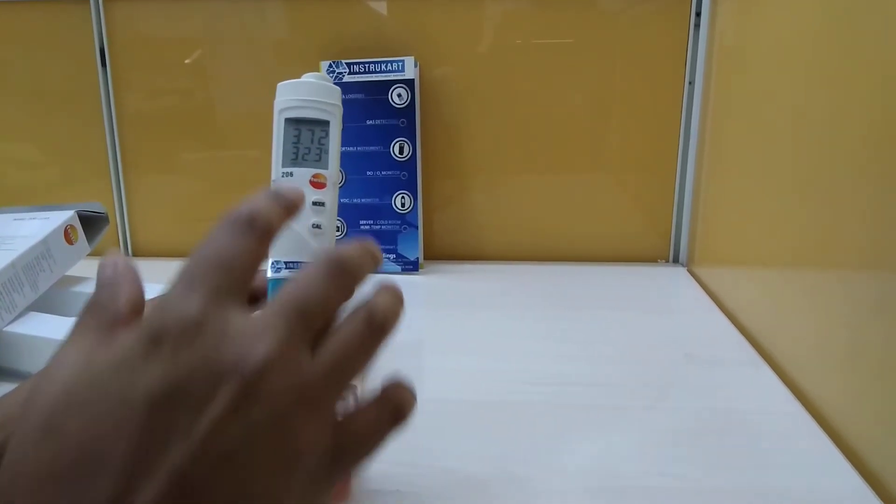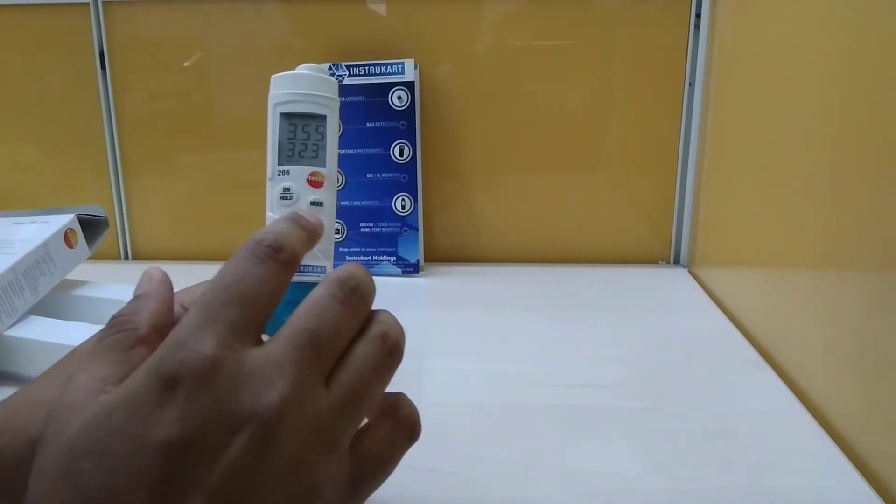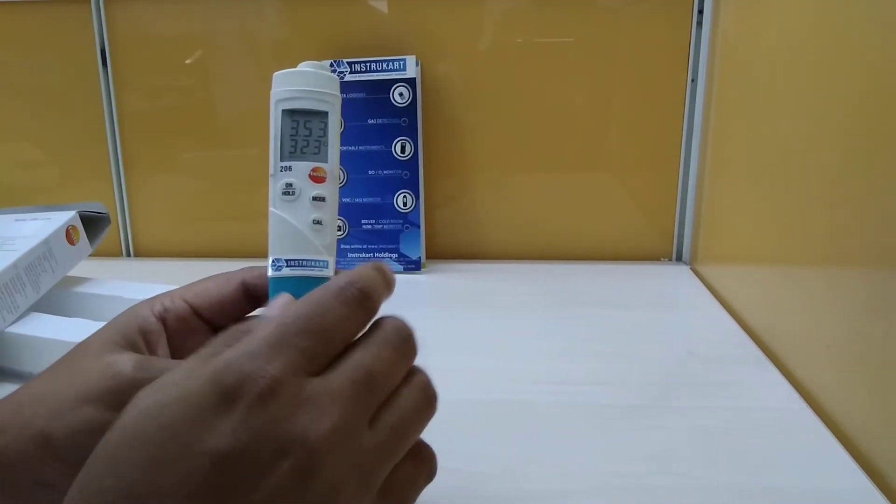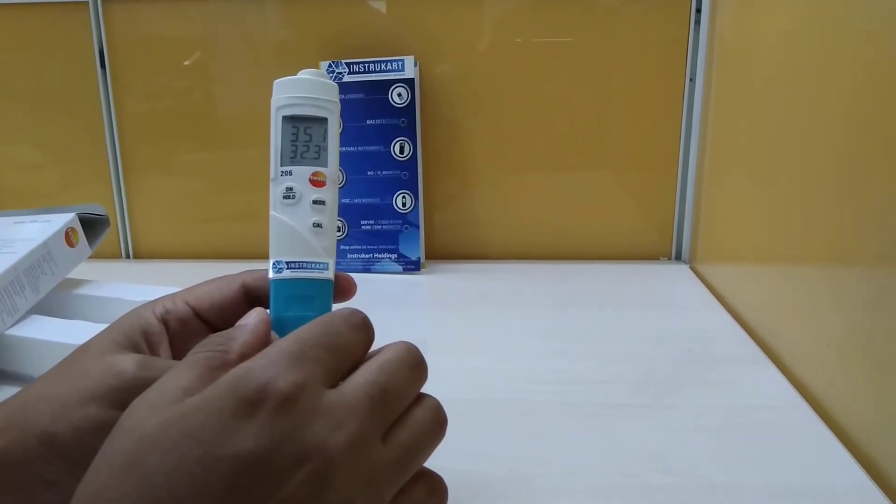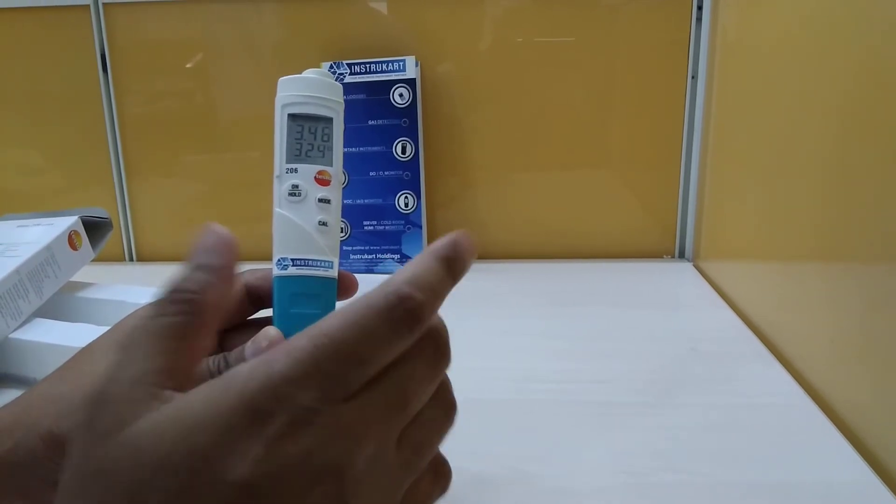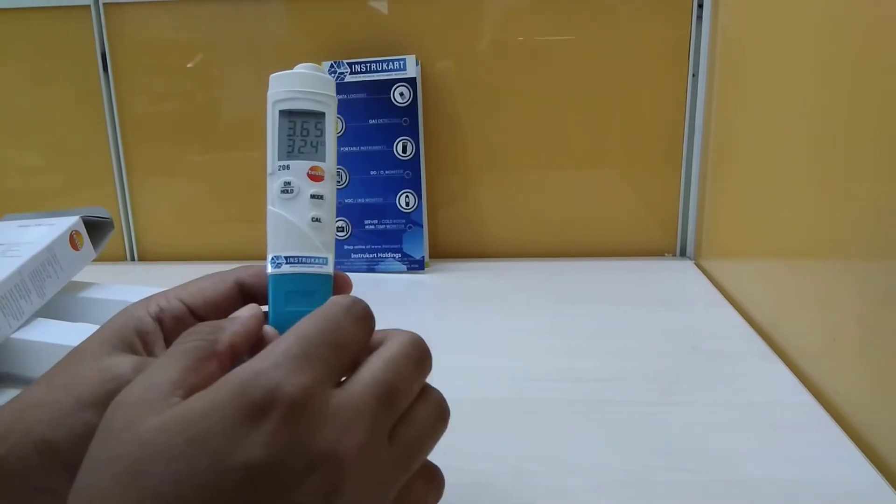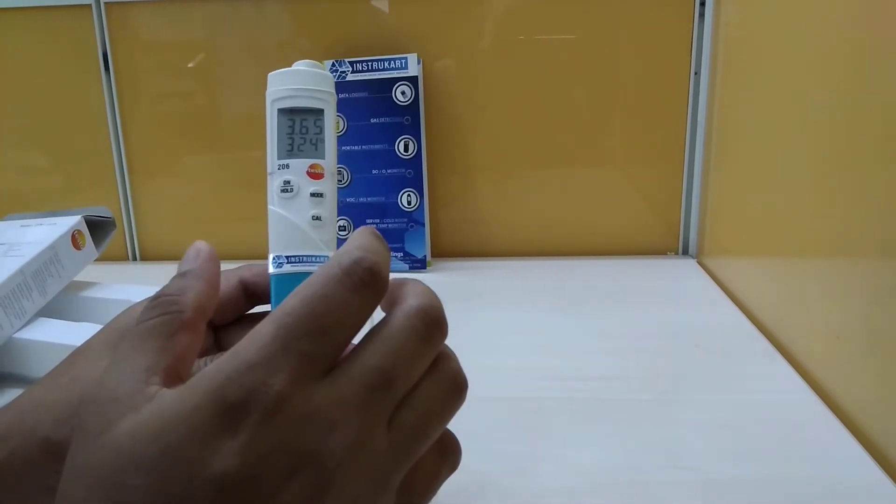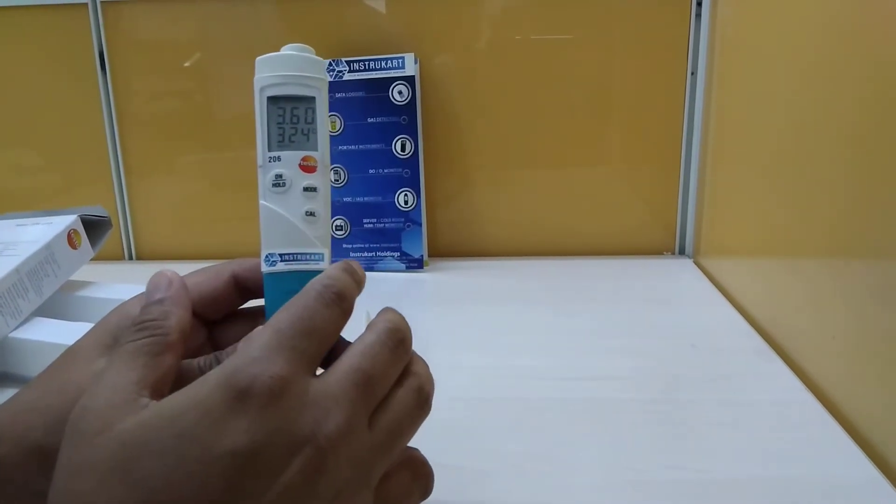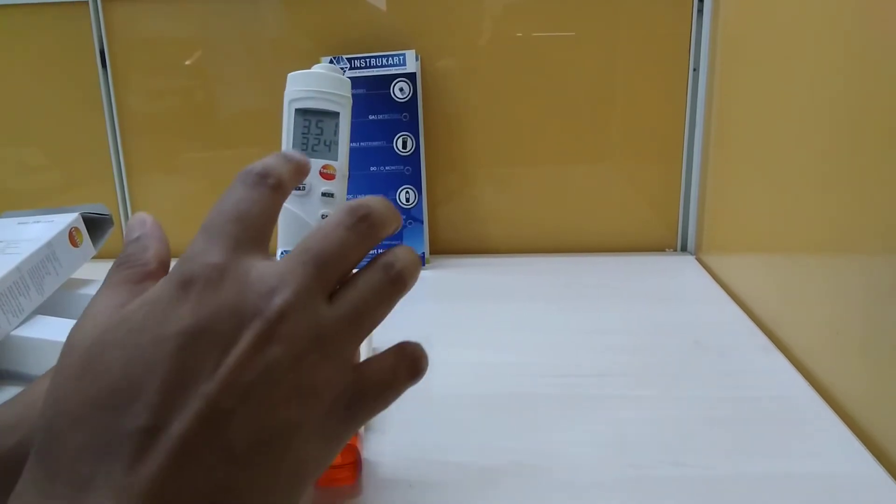The resolution of pH is 0.01 and temperature is 0.1 degrees Celsius. The accuracy for this pH meter is plus or minus 0.02 pH, which is great accuracy for this instrument. The display, as you can see, is LCD.